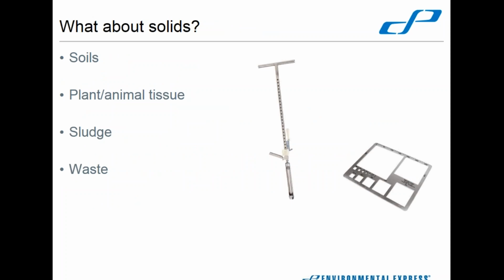We talked a lot about aqueous materials. That's not all of the sample collection. There's solids. I'm not really going to get into the solids. That's an entire topic of conversation, how solids get done, mostly because of representative sampling. Aqueous materials are pretty simple just because most solutions are going to be homogeneous in nature. Obviously, particulates can float by, or we talked about oil and grease, non-homogeneous in water. But generally speaking, your aqueous samples are going to be homogeneous when you grab that out of the stream, river, well, whatever it is you're doing.